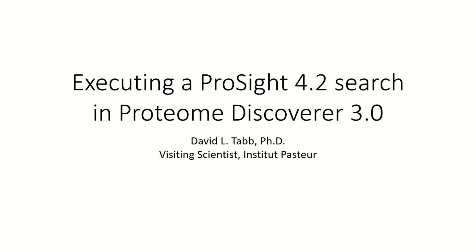Hello, I'm Dave Tabb, and today I would like to walk you through your first search using ProSight 4.2 in Proteome Discoverer 3. This is a very widely used software framework that we use for identifying top-down proteoforms for data-dependent proteomics of intact, undigested proteoforms.